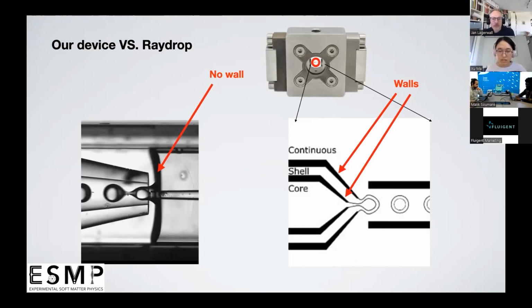And another thing is our handmade device is unrepeatable because the whole device making process is mainly produced by hand. So it's really hard to produce two handmade devices at exactly the same size.